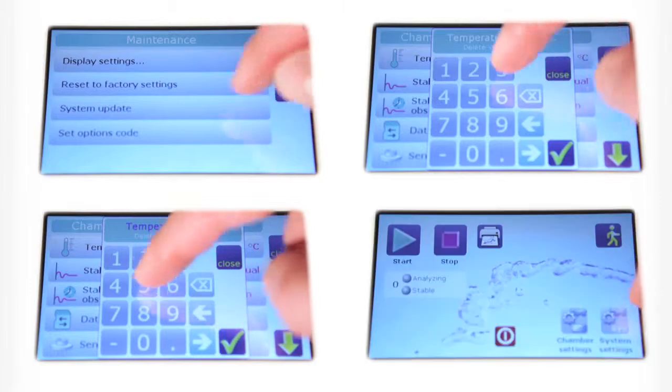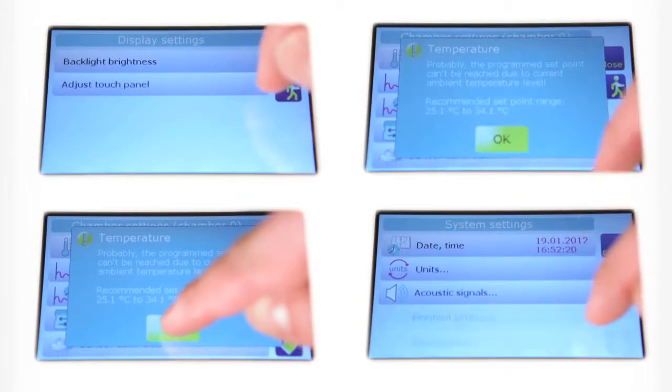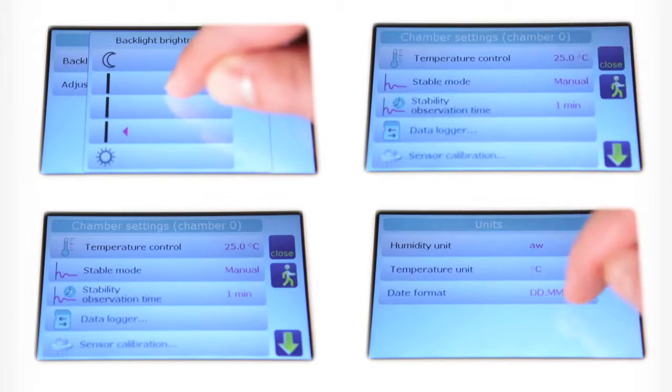The user-friendly menu allows fast and easy instrument programming, calibration and adjustment. The clearly arranged and easily accessible icons provide various functions and make instrument operations simple to follow.